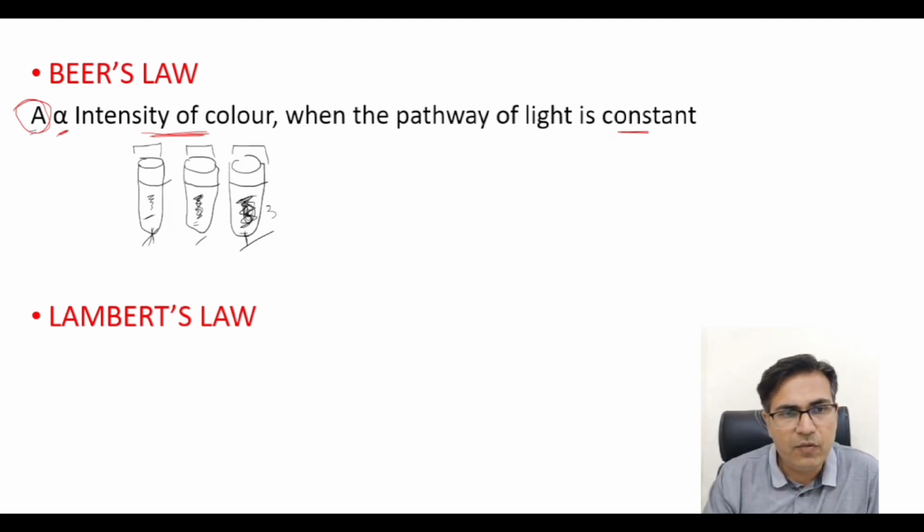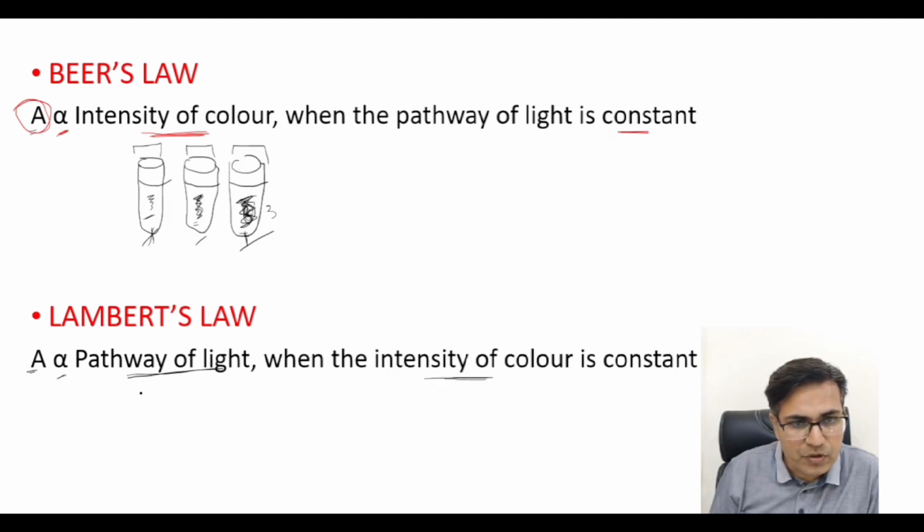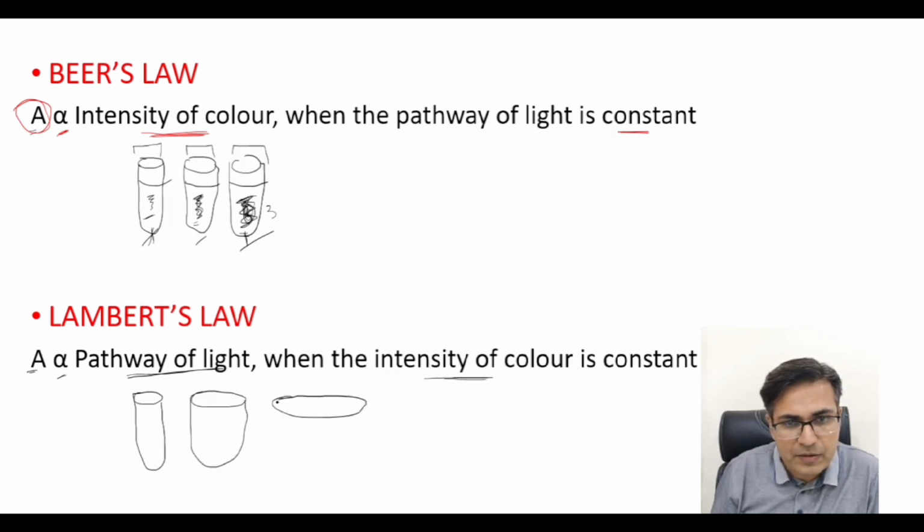Now what is Lambert's law? Lambert's law says that absorbance is directly proportional to the pathway of light when the intensity of color is constant. So suppose we have one solution, then we check the intensity, we pass the light, and the pathway of light is increasing.